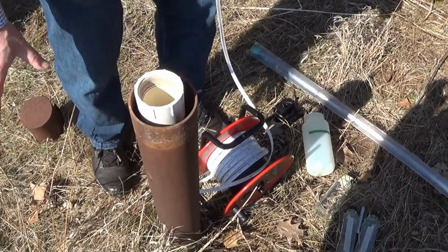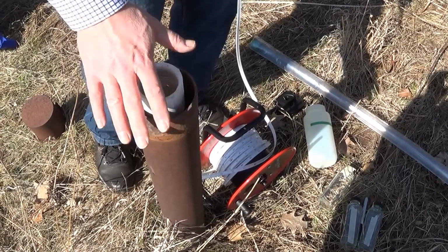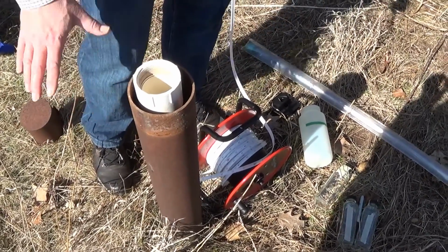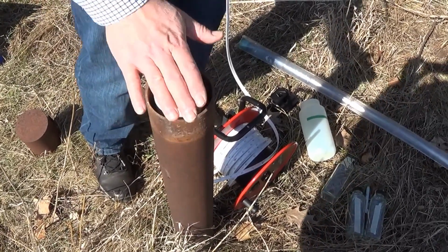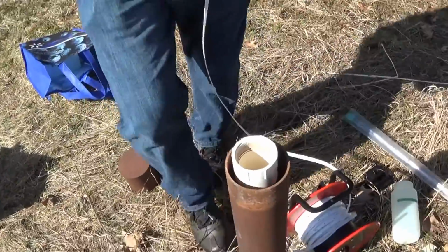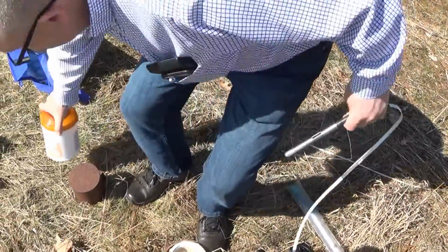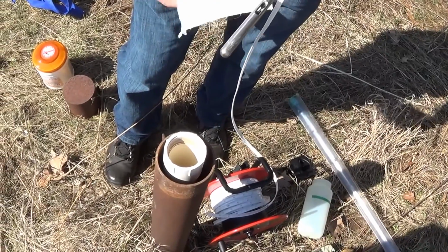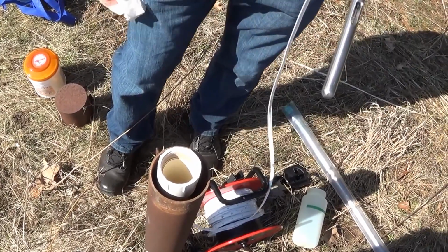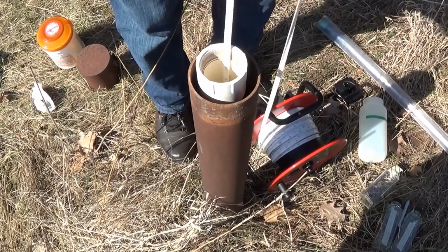So as I open this well top, if this could be a hazardous waste site, first thing we want to do is measure for any volatile organics, just to see that this is a safe environment. If we need any additional personal protection equipment, I did not bring a meter with me, but we would measure the VOC. I know this is not a hazardous waste site. What we would also do, because we're going to also take some fecal coliform and E. coli testing of this water, is disinfect this probe because we do not want to introduce any biology into that groundwater that would give us a false positive hit on the E. coli. So once we've done that, I'll lower this down and you'll hear the beep and we'll take a reading.